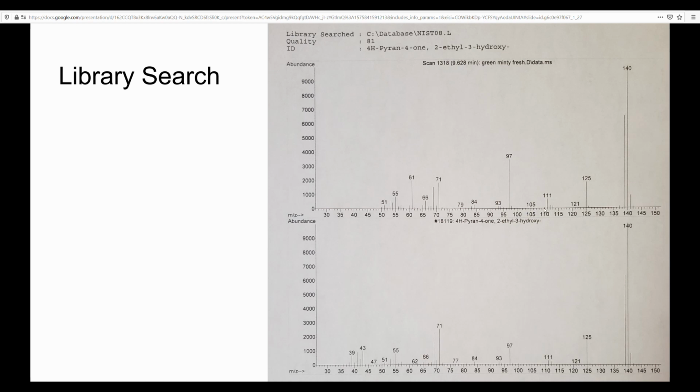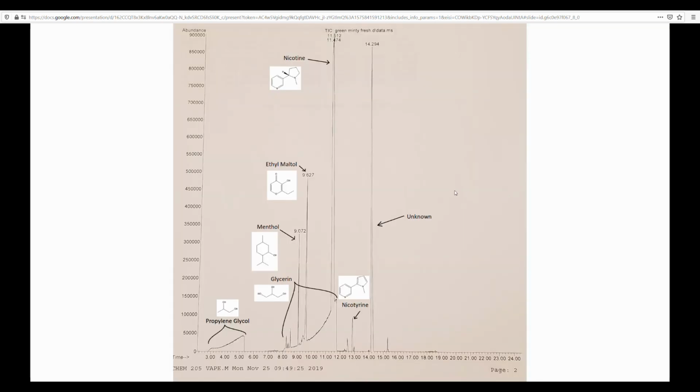They're kind of similar, but there are small differences, and these small differences can really throw your search off if your compound is particularly dirty. In this case, we were able to spot most of the significant peaks. The main one is nicotine, which you can see here at 11.4 minutes. There's a lot of it in here. The package says it's like 4.5% nicotine.